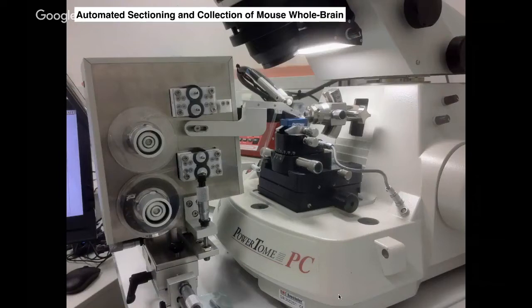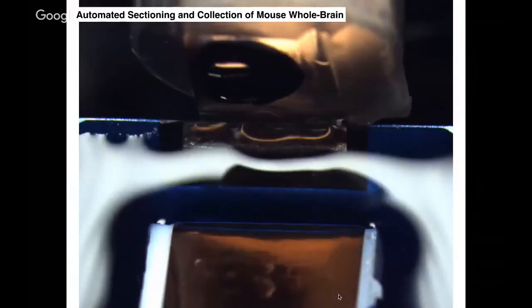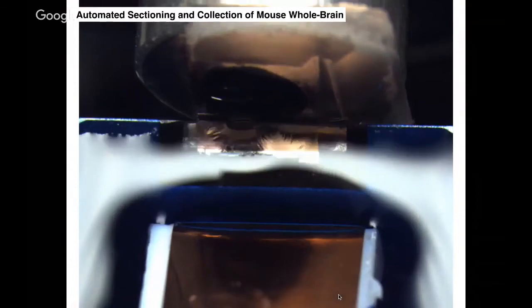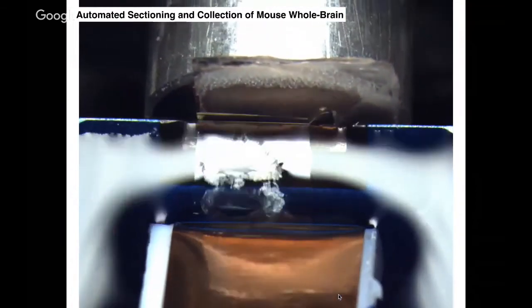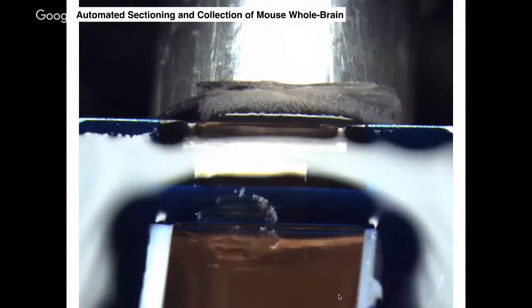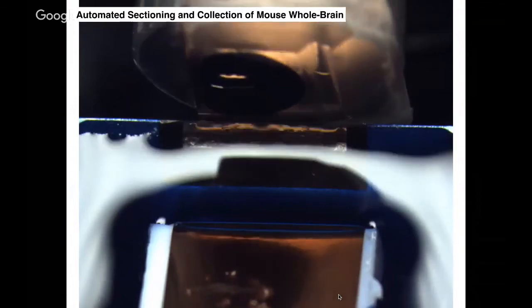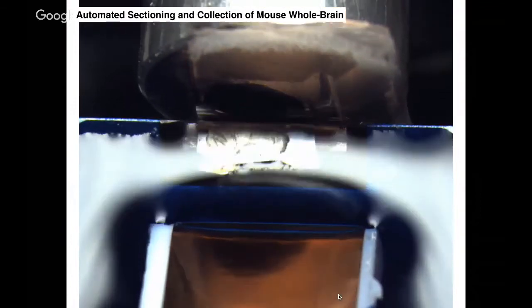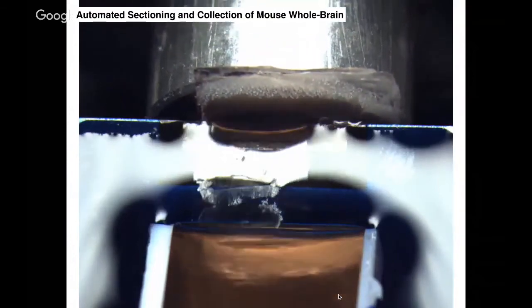What I show here in the sample holder is one of these whole mouse brain samples. And if you just start cutting, so this is through the olfactory bulbs of a mouse brain sample. Actually, it looks to be just a slab and not the whole brain in this case. So this is not the full size of the mouse brain. This is about maybe 4 millimeters by 2 millimeters area that it's cutting through. But you should be able to see both olfactory bulbs in these sections that are coming off. The sections are 50 nanometers in this case.